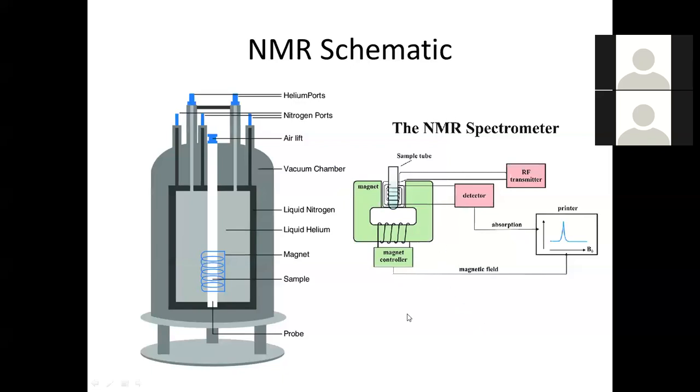The problem with that is you have to keep it extremely cold. So you see liquid helium surrounding this superconductor material, keeping it at roughly 4 Kelvin. That's the liquid helium temperature, where it boils. And liquid helium is extremely expensive. So there's usually a jacket of liquid nitrogen around that to help further shield, and then vacuum around that to help even further shield your loss of helium.